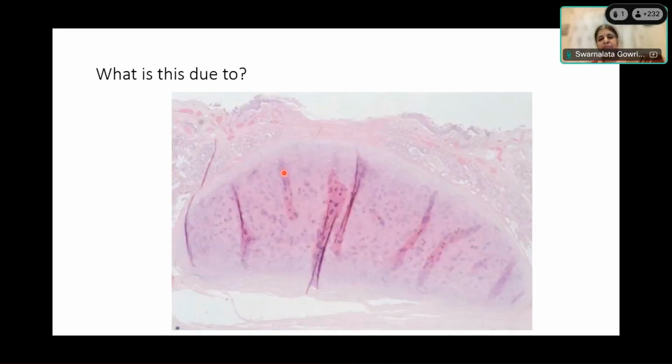Okay, this? What is this due to? What are all these? There are folds in the section. Folds. And where exactly do folds occur? Folding of tissue. After trimming, if they're not spreading the ribbon shapes. Yeah, not trimming. When they're after cutting.